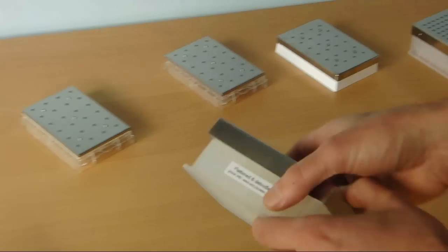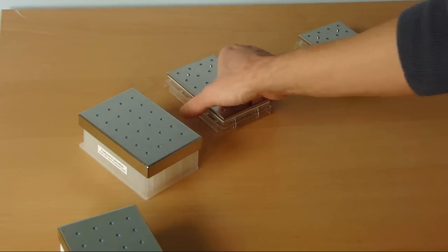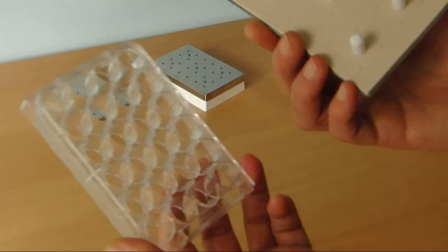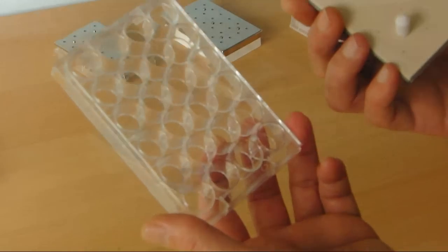We also have special covers for Corning 24 round well plates that allow culture volumes of up to 1 ml, both in a normal and in a low evaporation version.